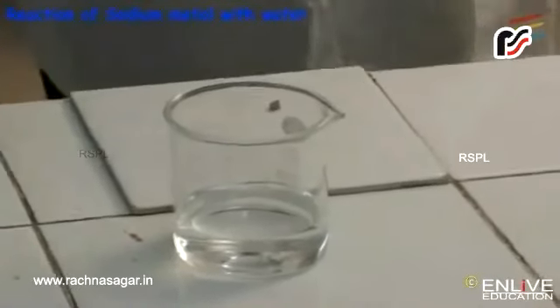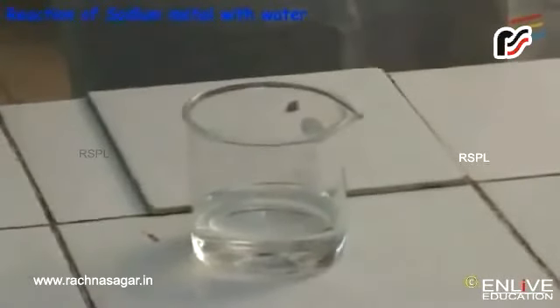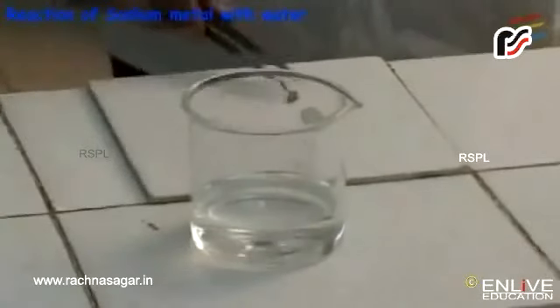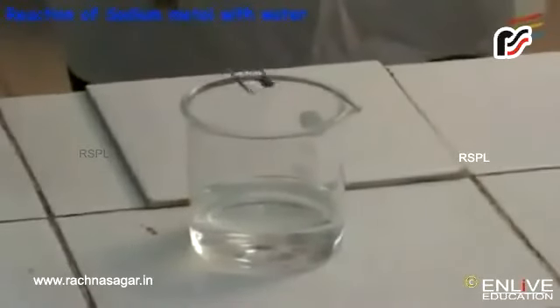I am going to show the reaction of sodium metal with water. In this experiment, you have to be very careful and it should be performed in the presence of the teacher. Let me add a bigger piece of sodium metal into water. Let's see what happens.